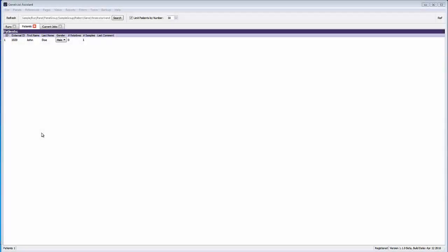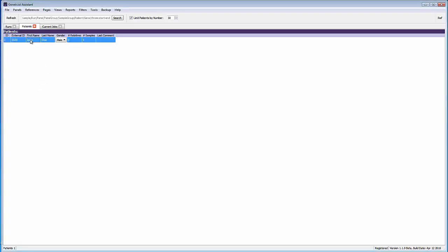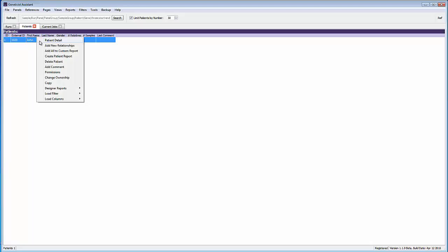Once the report template is created, you can very quickly create the report for any patient by selecting the patient from the list of patients, right clicking and choosing designer reports, and then selecting the appropriate report template. The report will be saved in PDF format.